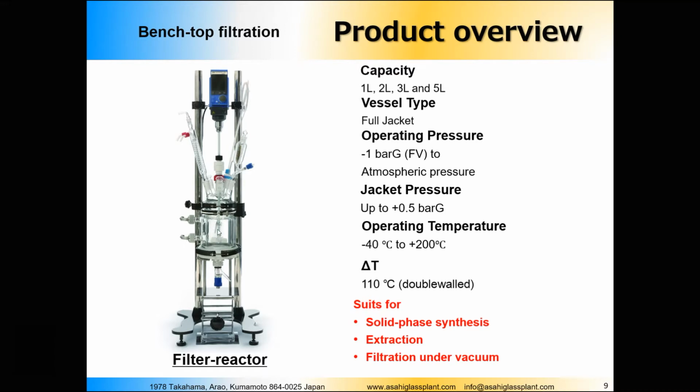And in the end of the process, by adding a special chemical reagent, you cut the peptide that you got off the surface of this polymer. The particles of the peptide are very small, so you can easily filter them, and you will have the remaining polymer inside the vessel, and you will get the solution of the relatively pure peptide in your flask after filtration.